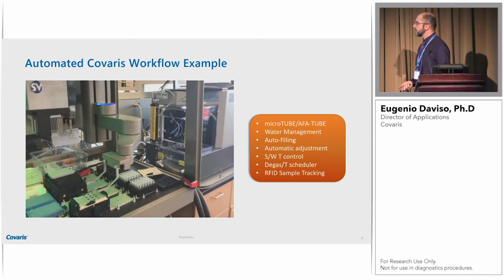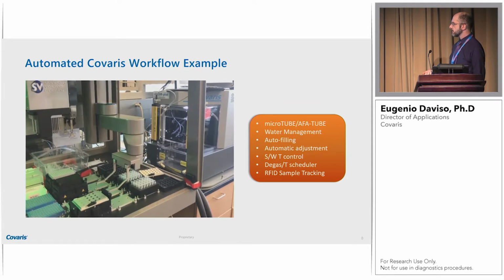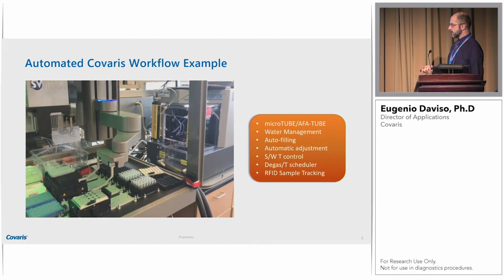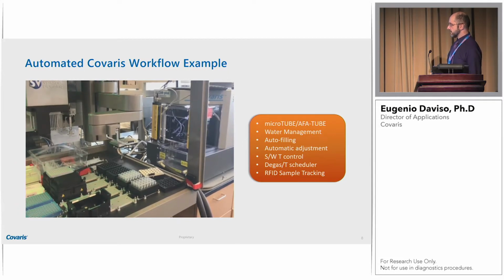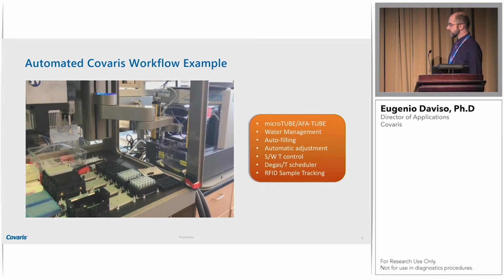This is an LE220R Plus that is coupled to a Lynx through a robotic arm and a gripper. Specifically, this was a 24 format microtube 130 that, as you can see, is taken with the gripper into the liquid handler. It goes into the AFA instruments, it gets processed.